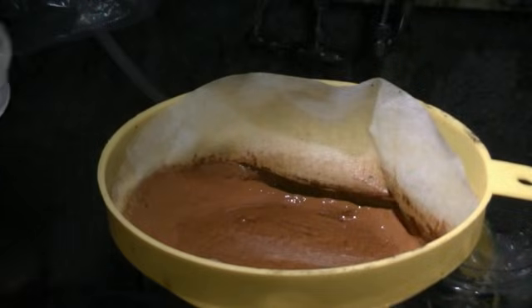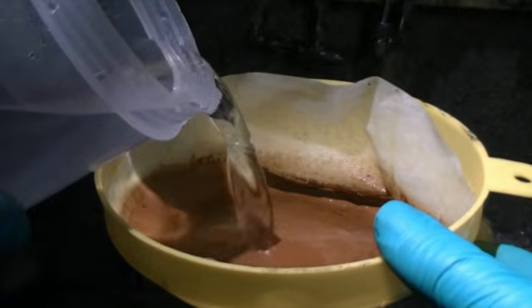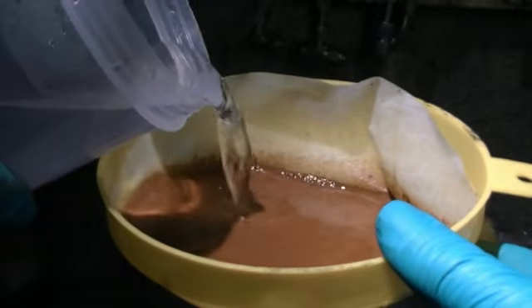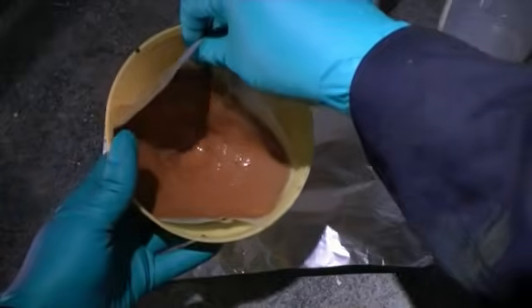Since copper oxide is not very water soluble, it is possible to wash away any dissolvable salts using demineralized water. When most of the water is drained through, we can then carefully remove our filter paper and allow it to dry.